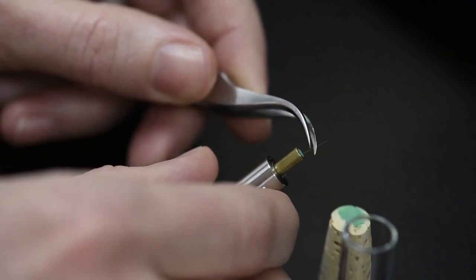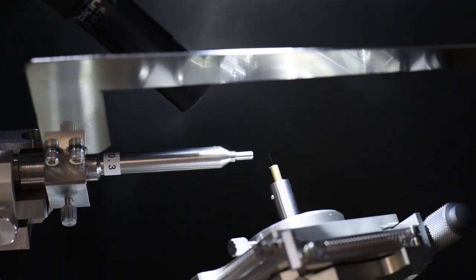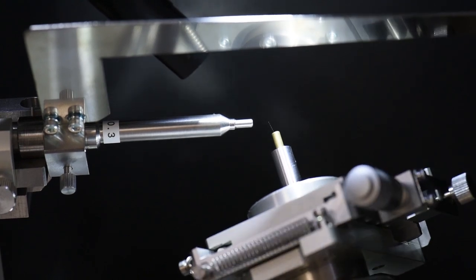From just a few tiny specks, which are barely visible to the human eye, or a few fibers, we can answer the fundamental question: What is this sample made of?